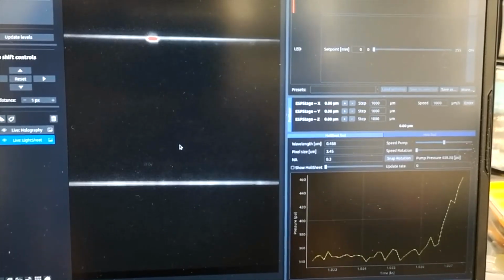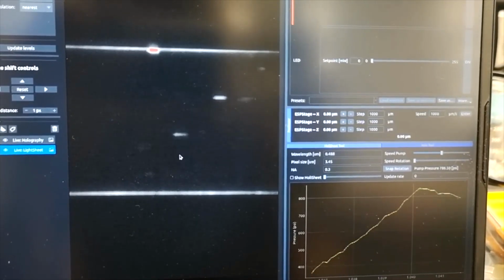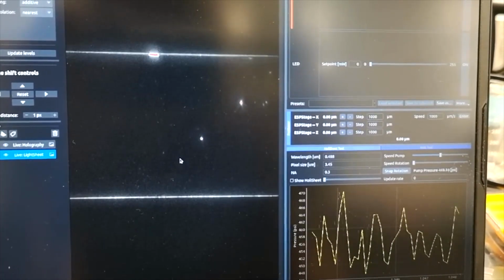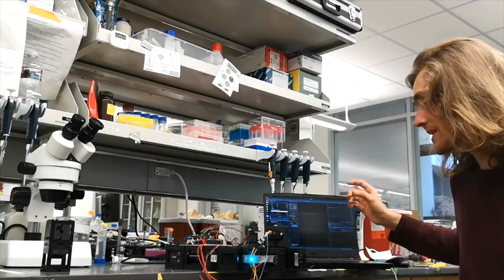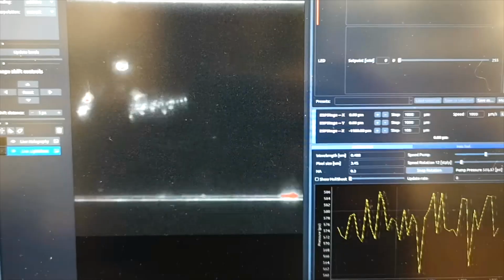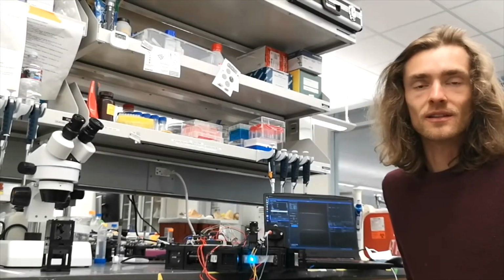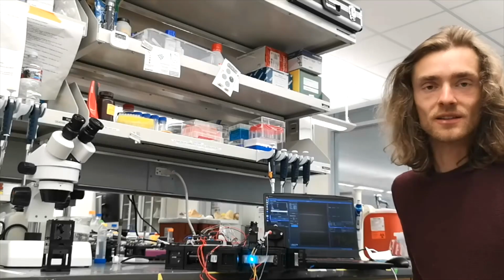When I initiate the pumping, you will see on the screen that some parts are going through, and the pressure goes up as well. We will go to automatic mode so that we can move the sample forward continuously and also rotate. While the sample is rotating and going through, the sample makes a spiral through the static light sheet, and with this you gather 3D information over time. Then the image processing, which is not yet implemented here in ImSwitch, does the reconstruction.